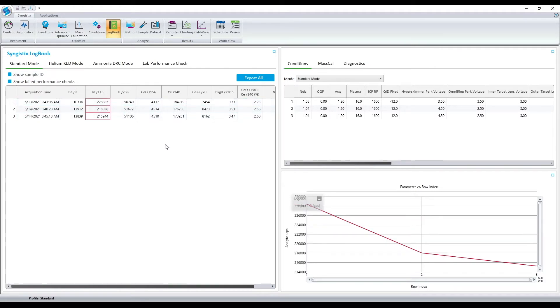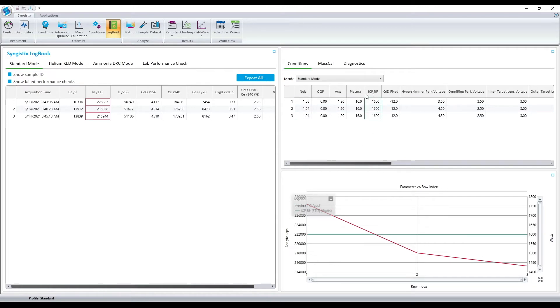Up to two different units can be plotted on the y-axis at a time. In this example, counts per second is on the primary y-axis and power, or watts, is on the secondary y-axis.